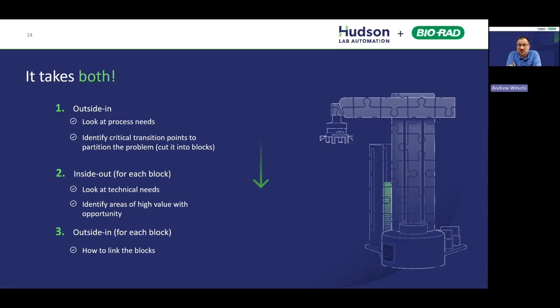Or logical steps where within an individual area, you have certain technical needs that are associated with it, whether it's temperature control, environmental control, or sometimes if there's incubations or out-of-house processes, right? There's a lot of drivers that will tell you how you want to break up that process from an automation standpoint. That's really architecting, right?